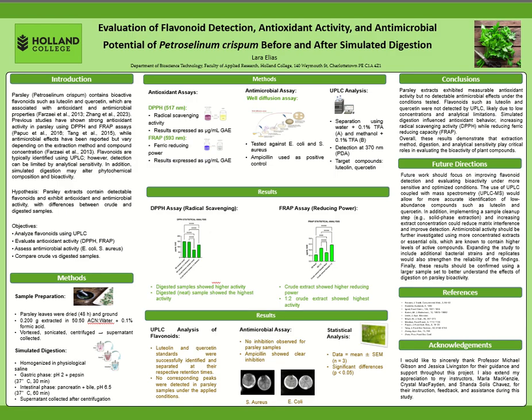In conclusion, parsley showed antioxidant activity but no antimicrobial effects under the tested conditions. Flavonoids were not detected by UPLC, likely due to low concentration and detection limitations. Simulated digestion altered the antioxidant behavior, increasing radical scavenging activity while reducing ferric reducing power.